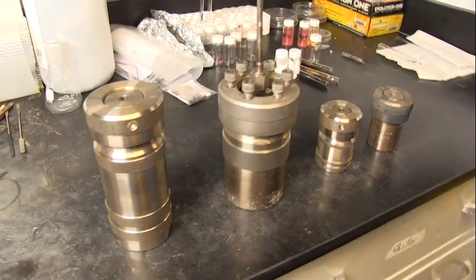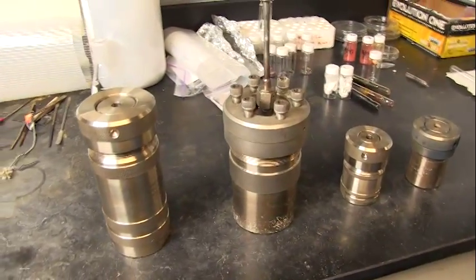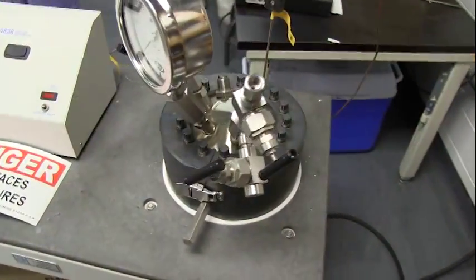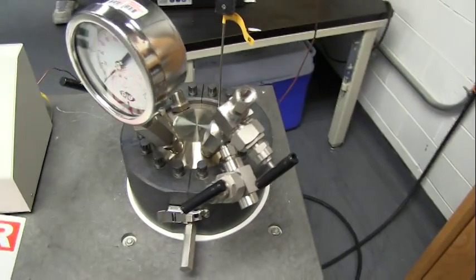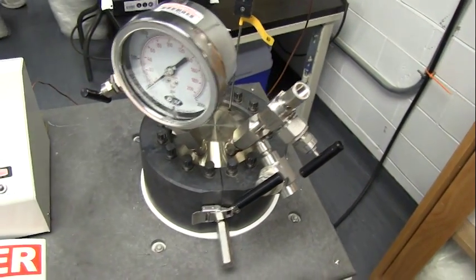If you use laboratory reactor pressure vessels in your experiments, it's important to understand what conditions increase the hazards associated with use so you can prevent dangerous ruptures from occurring.